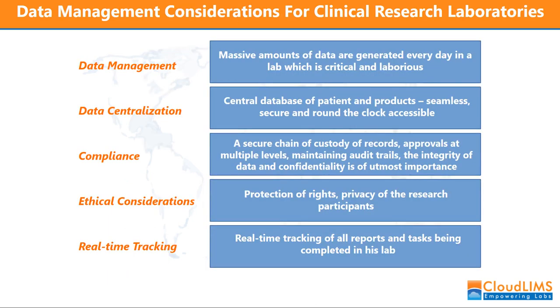As a data manager for a clinical lab, these are tasks you must manage. Managing massive amounts of data generated from the laboratory, sharing your data with other systems or other databases inside and outside of your organization. Compliance with regulatory and privacy demands with traceability.